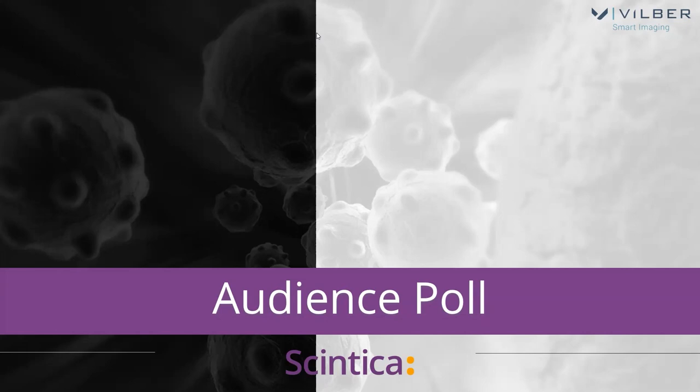Okay, so we have time to answer one more question. And the question is, can you explain the options for chemiluminescence in regards to stacked or accumulative exposure in more detail? Yes, sure. So the serial imaging mode allows you to select a number of images you want to see. So first you select whether you want to see 5, 6, 7, 8, 9, 10 images, for instance, and you can choose an accumulation mode that is taking into consideration the previous image. And at the end, you can either see the images individually or stacked.